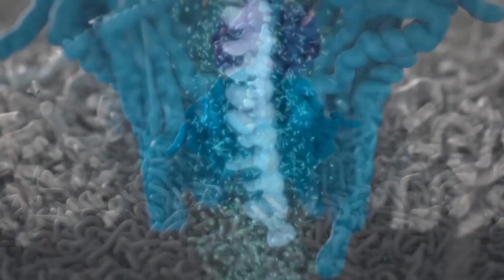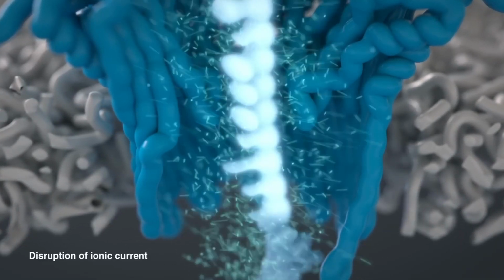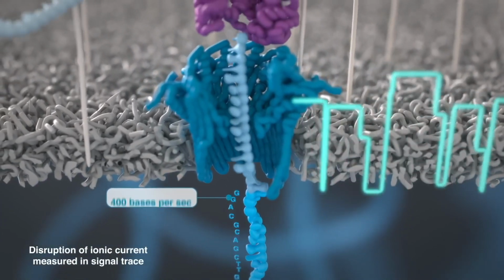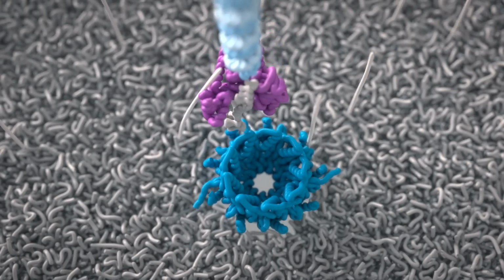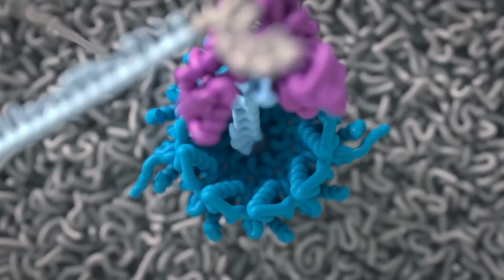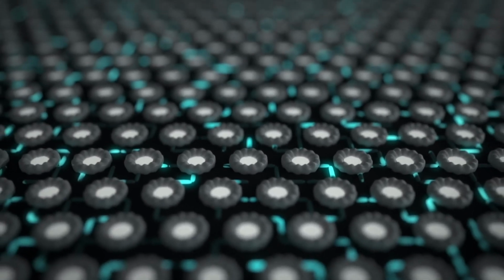And you'll see now that as the DNA moves through the pore, there are electrolytes that move through, and that obviously creates an electrical signal. This pore protein will dance around, given the sequence that's being pulled through the pore, and an electrical signal is generated off that. That electrical signal can then be interpreted with a machine learning algorithm to convert the electrical signal to your base calls, AGCT.